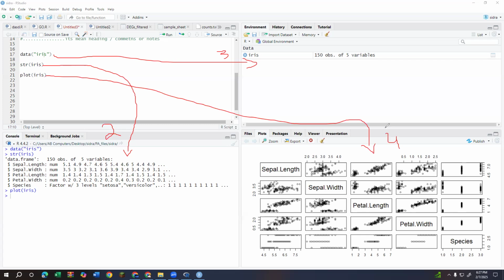Okay, please all participants, if you have any question, you can ask. If clear, please type clear within Zoom chat so that I can move to next step.